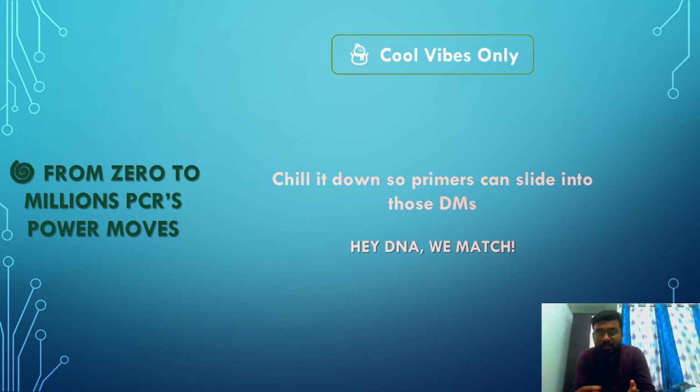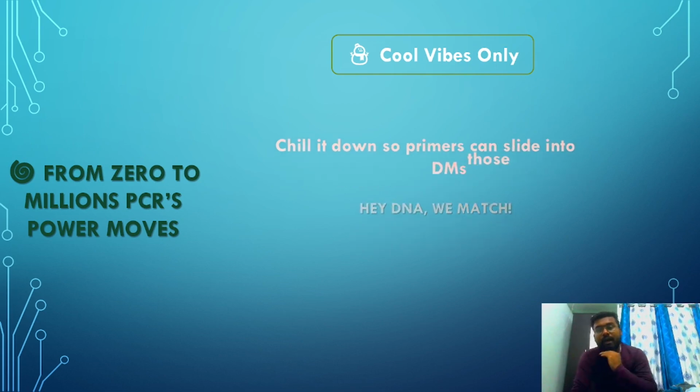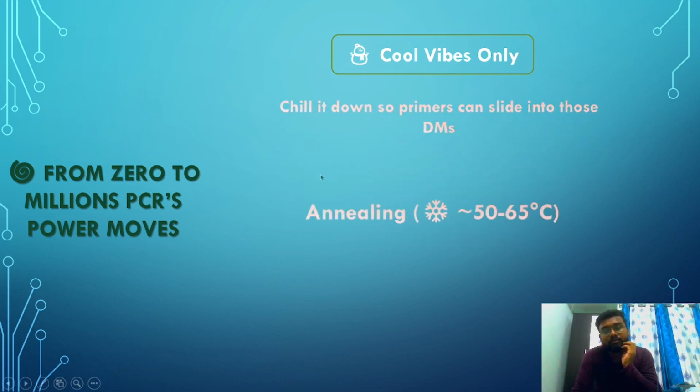It's not like I'm matching with anyone randomly, no, not like this. We have to be very precise. We have to be very selective while going for our next match. And this is called annealing.